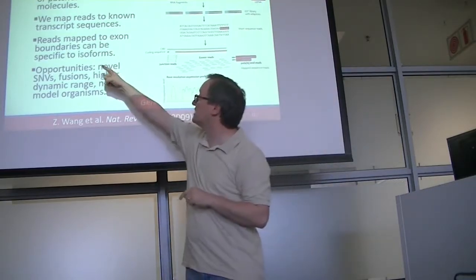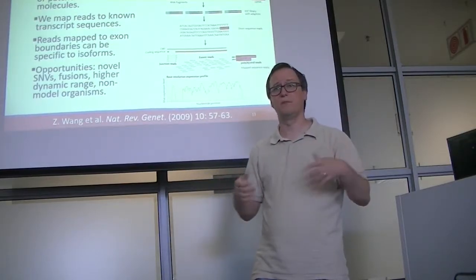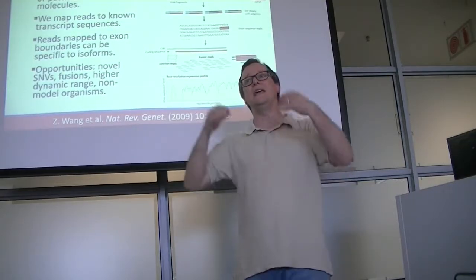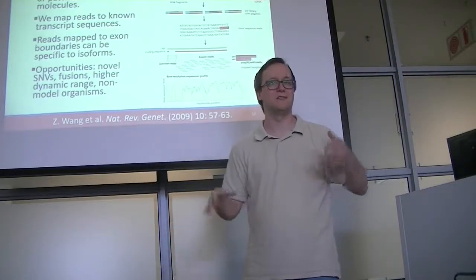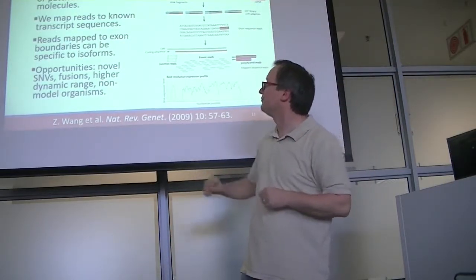So we frequently see that this mapping process needs to be isoform sensitive. Isoforms being, a gene produces multiple isoforms when it produces multiple messenger RNAs. So we call each of those messenger RNAs an isoform in some cases.